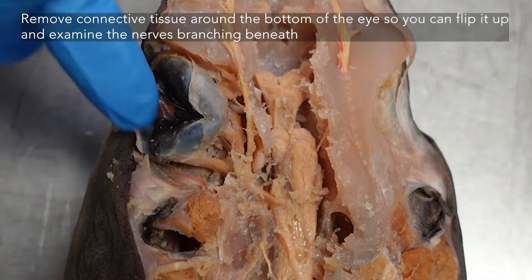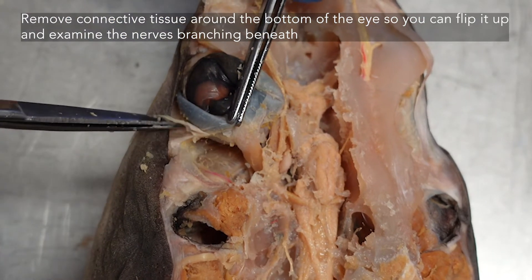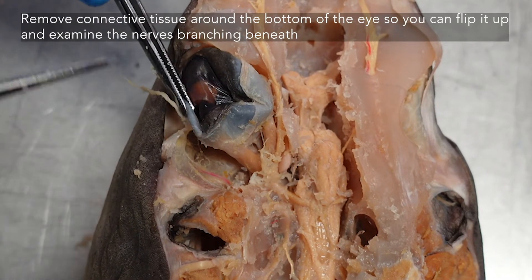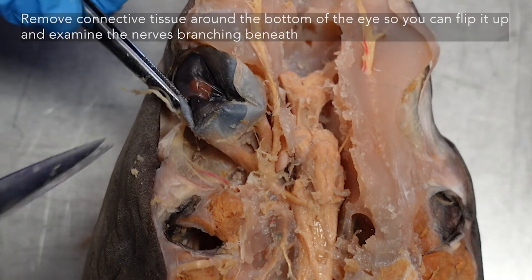As you're going around the eyeball, you will need to lift the eye up and remove the connective tissue anchoring it down there. After that there's not too much cleaning underneath. You just need to see your infraorbital trunk and its branches — the maxillary and buccal branches that come out of it.